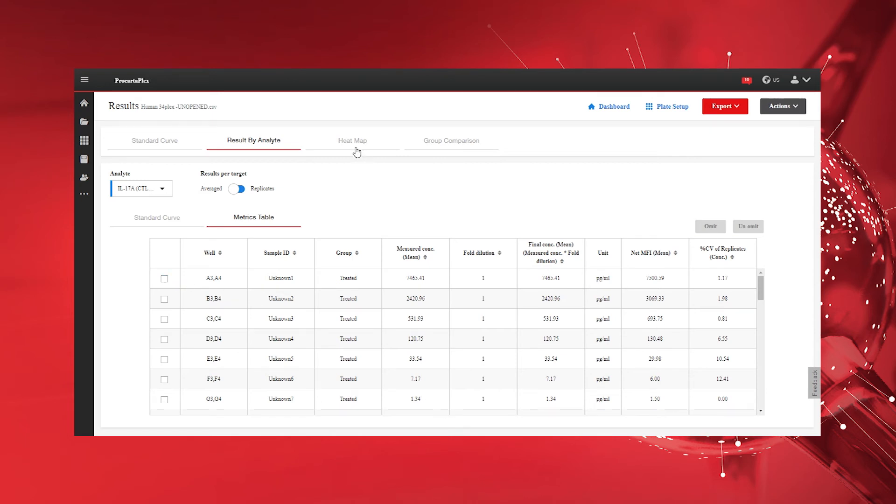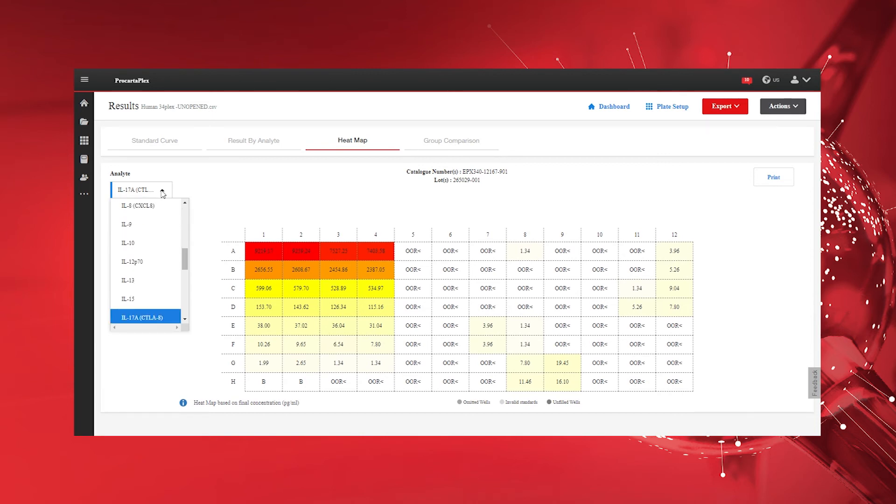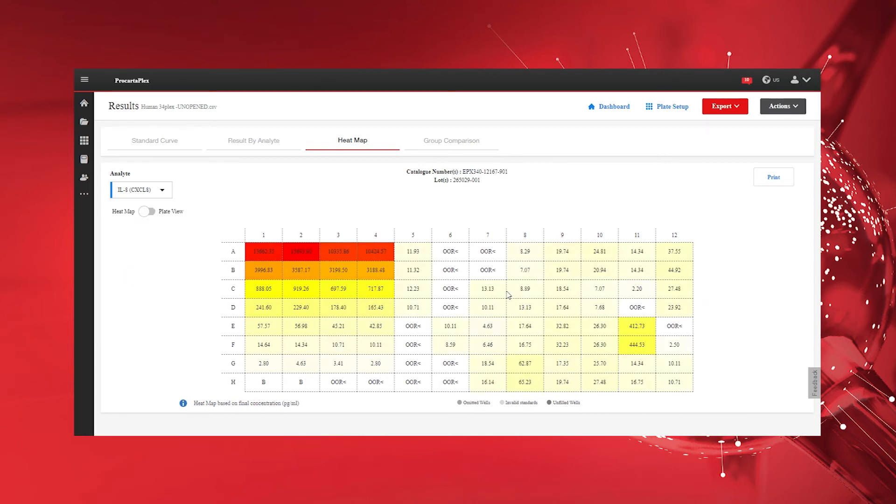The Heat Map tab provides a comprehensive plate view of your sample patterns. Easily print heat maps by clicking the Print button.